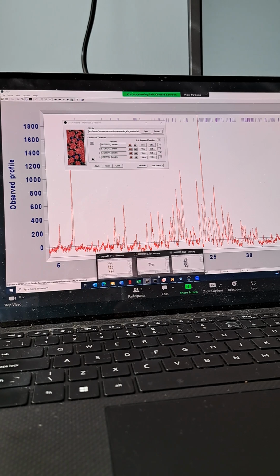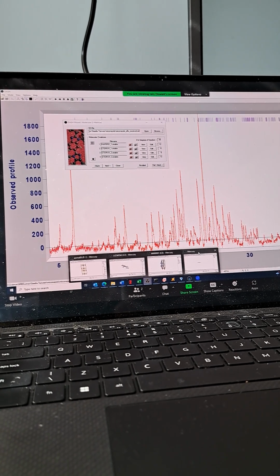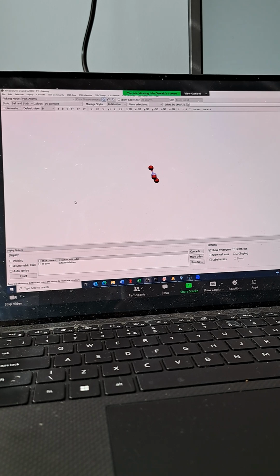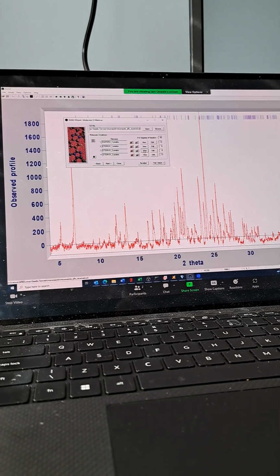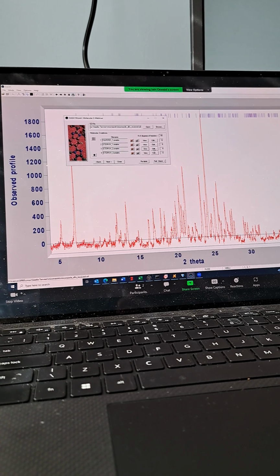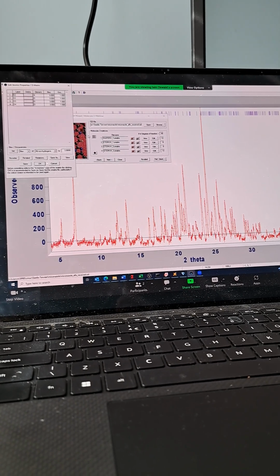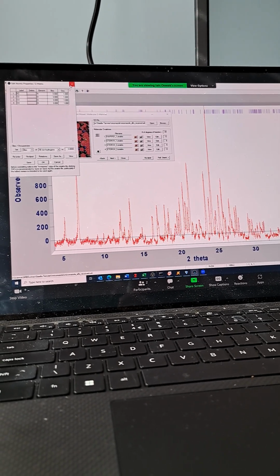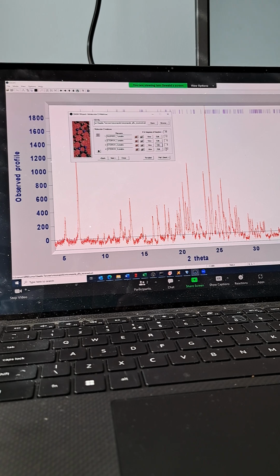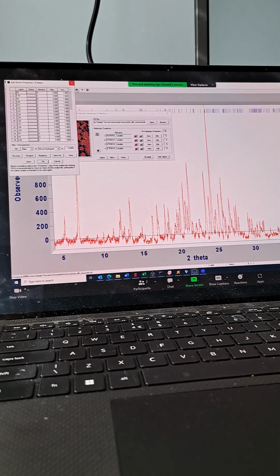I'm just waiting for this to fire on. Okay, so there's my nitrate. But I've also got another nitrate that is going to be here as well. So I can view this if I want to, or I can edit it and say, that's NO3. I know that's nitrate. But I've also got my miconazole here as well. You can see that's there.